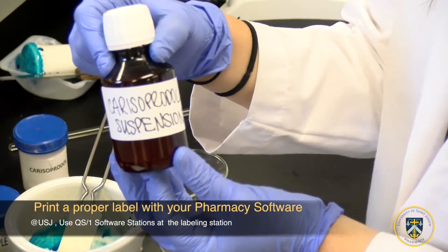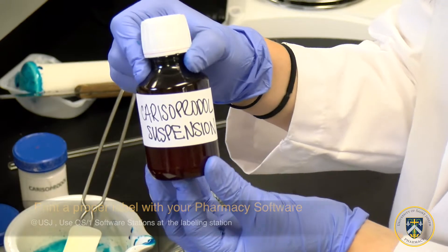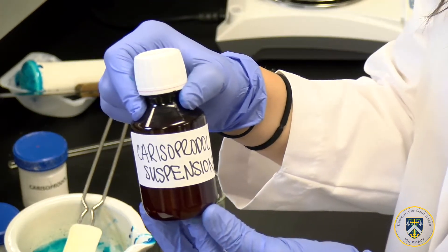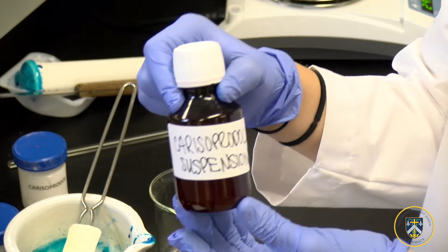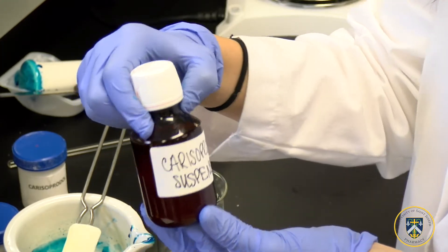Now that we've labeled the amber vial as carisoprodol suspension, the patient will be able to take this medication for a maximum of 14 days. This is due to potential microbial growth, degradation, and problems with sterility.